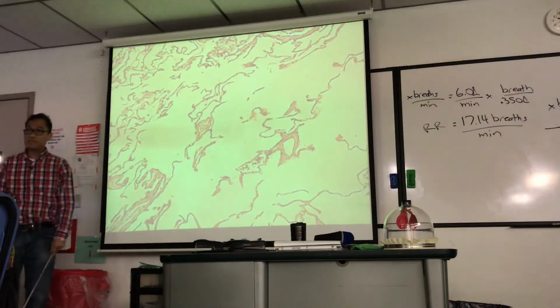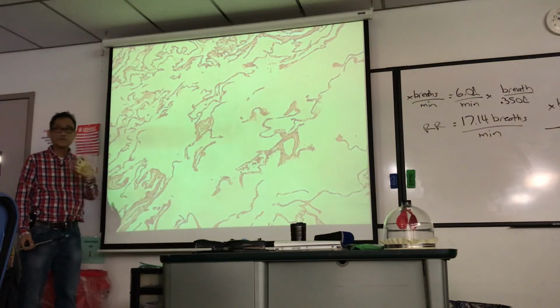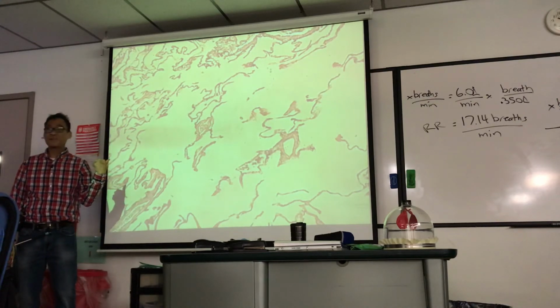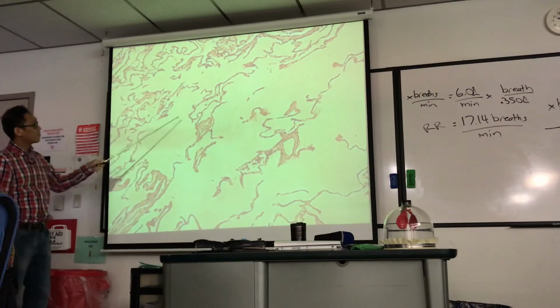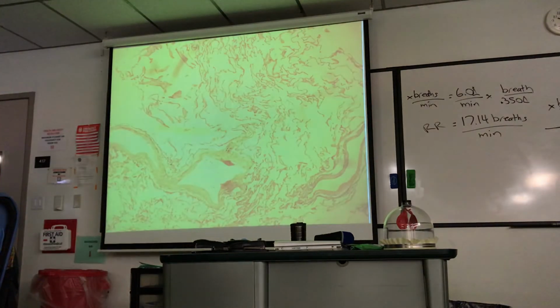How they describe it is, emphysema lung has fewer, larger alveoli. And if you just were to read that, you would think, oh, you got larger ones? That sounds good. Does that look good? Doesn't look good to me. Maybe you don't have very much experience looking at these things, but large alveoli, it barely has any integrity. You don't want that. So this is a lower mag of emphysema lung.